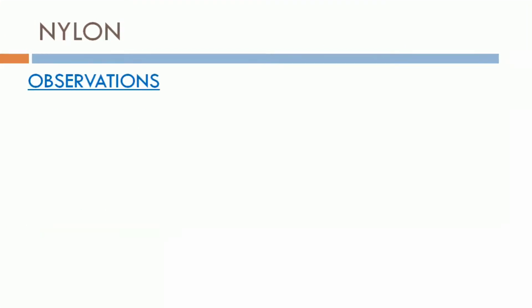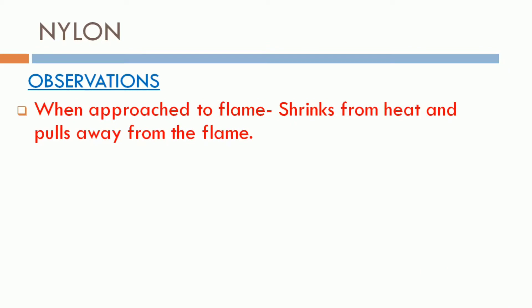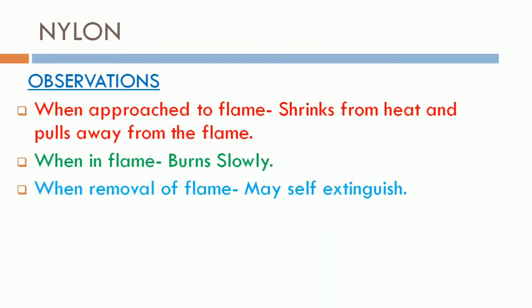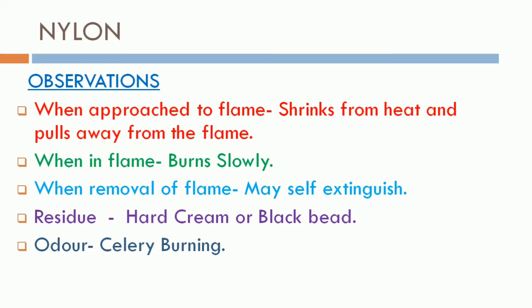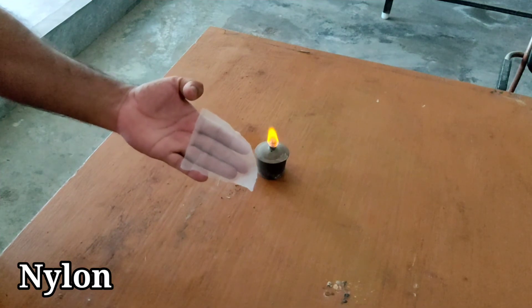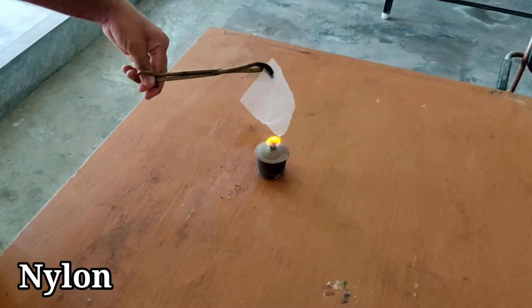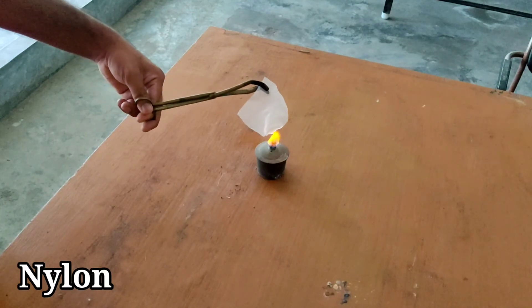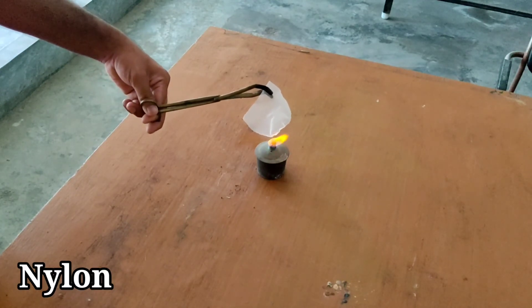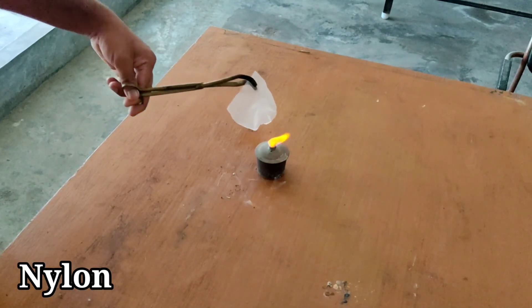Nylon fiber burning observations: when approached to the flame, it shrinks from heat and pulls away from the flame. When in the flame, it burns slowly. When removed from the flame, it may self-extinguish. The residue is a hard cream or black bead. The odor is like celery burning — a vegetable burning smell. Demonstrating with nylon fabric: it initially shrinks and pulls away from the flame.